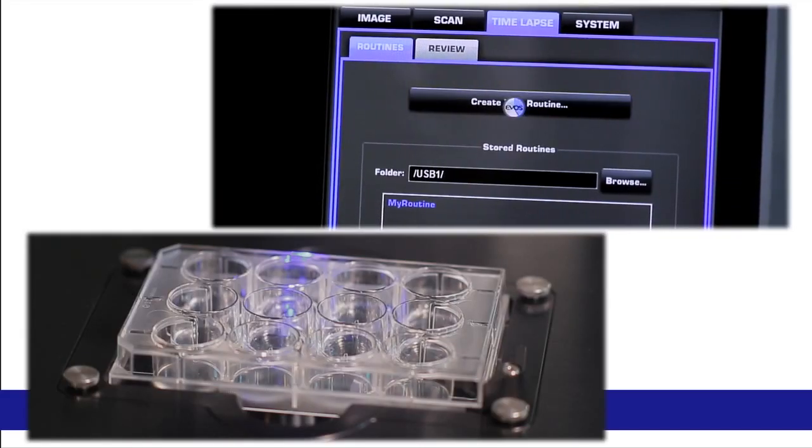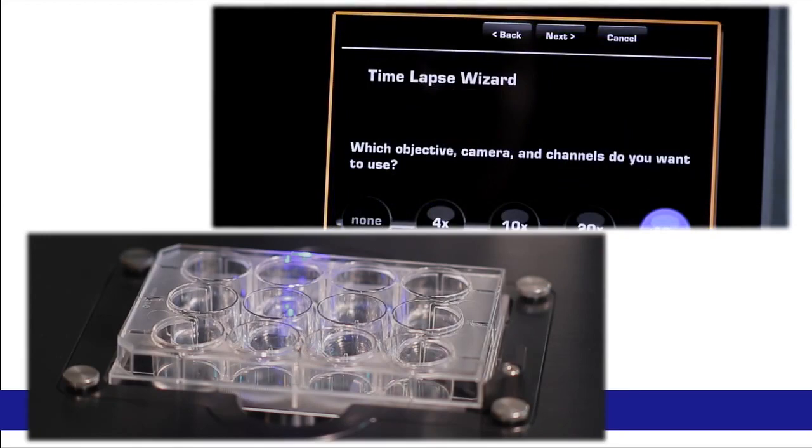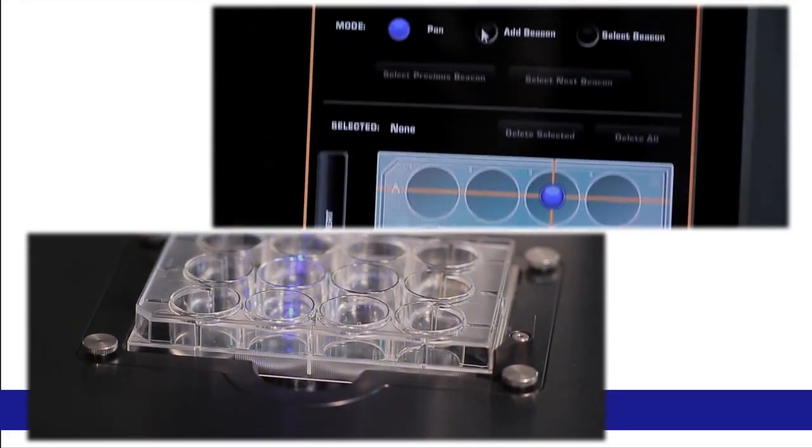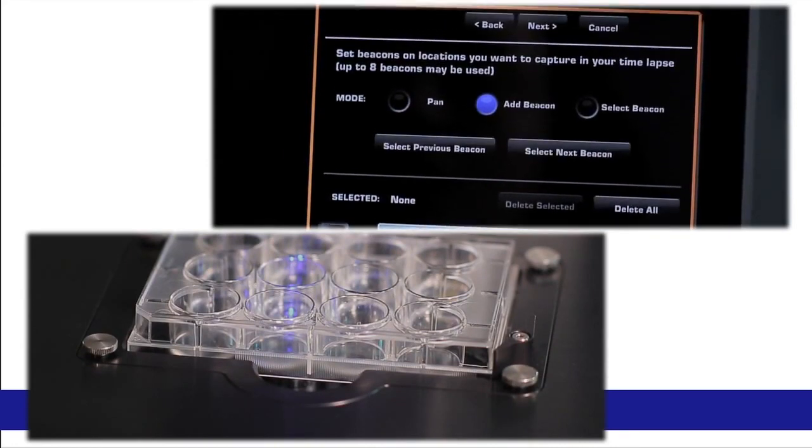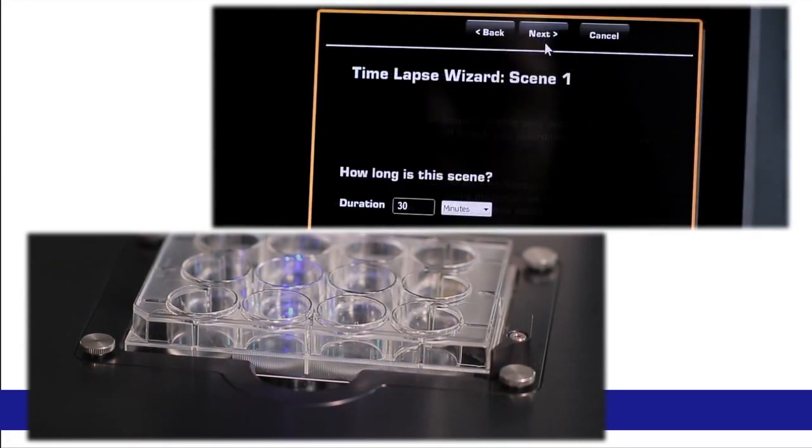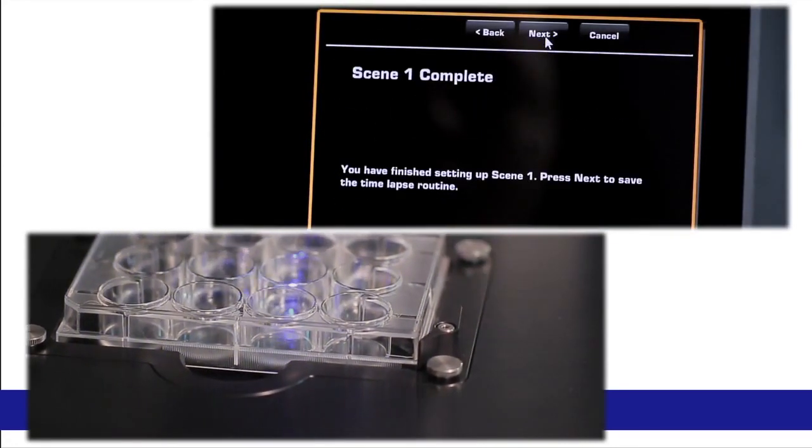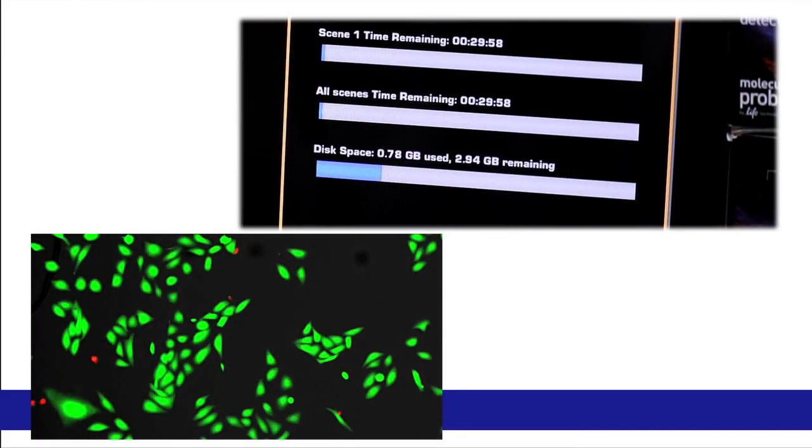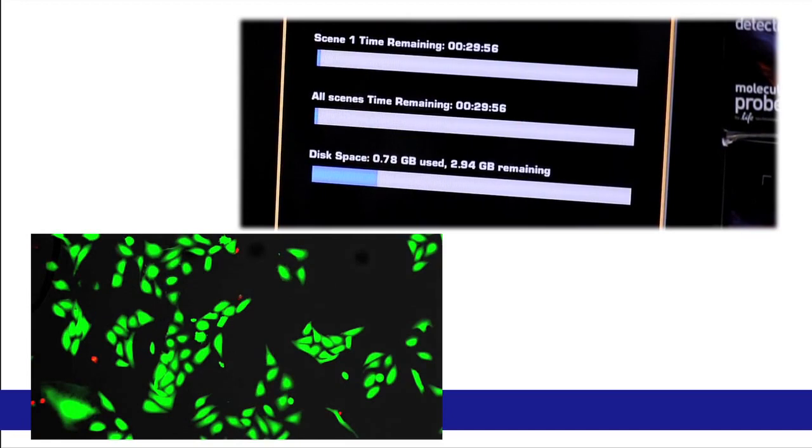The EVOS FL Auto cell imaging system minimizes the time and effort needed to collect time-lapse images. The automated system will even allow you to simultaneously capture time-lapse images at multiple positions on a plate or dish. After collecting time-lapse images, the EVOS FL Auto will automatically create a movie file for viewing the results.